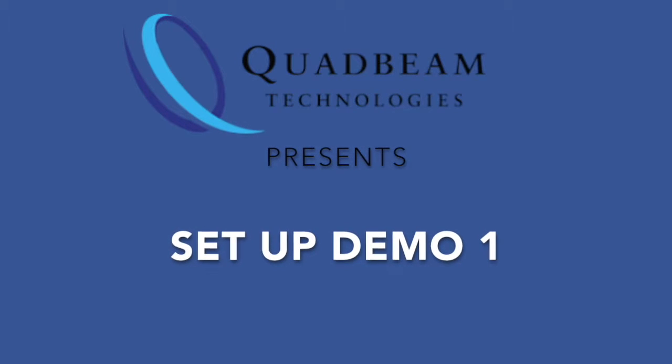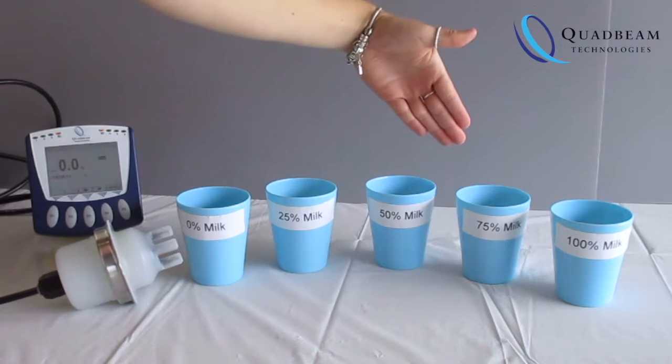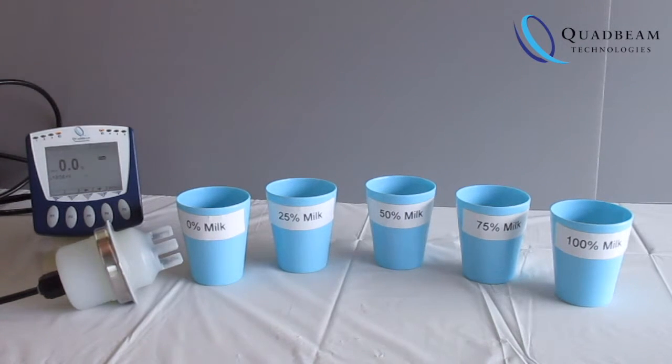This video demonstrates the setup of the linearization curve for a basic milk water interface application. In this case we've pre-prepared some samples placed in opaque cups with 0% milk through to 100% milk in milk water solutions.